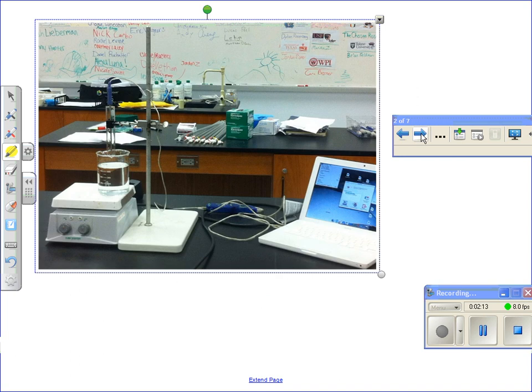Well, how are we going to do that? Your setup is going to look like this tomorrow. You're going to use a computer hooked up to a temperature probe. You see the temperature probe right here in the photo, and a little Mac laptop. We're going to use Data Studio. The setup involves a temperature probe and a boiling water bath. When you walk into class, it should already be going. You should have a hot plate and a boiling water bath, so the water will be boiling.